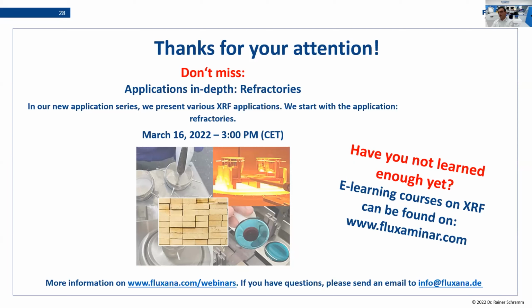So we discuss upfront with the producer how it is guaranteed that this material has a certain particle size and a certain process of homogenization, and only then we take it, and then we monitor what homogeneity, or inhomogeneity, is really the case.